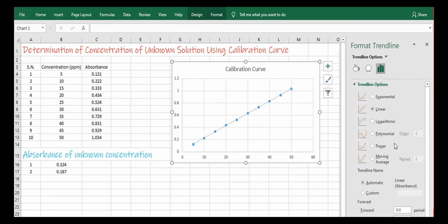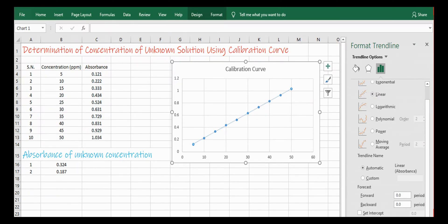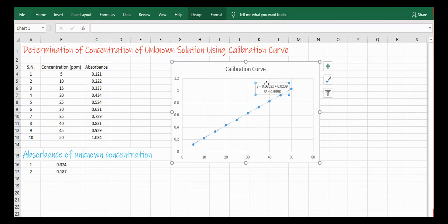You will see like this. Then go here and tick on Display Equation on Chart, Display R Squared Value on Chart. Then you will see like this. You can drag it anywhere and you can move it.